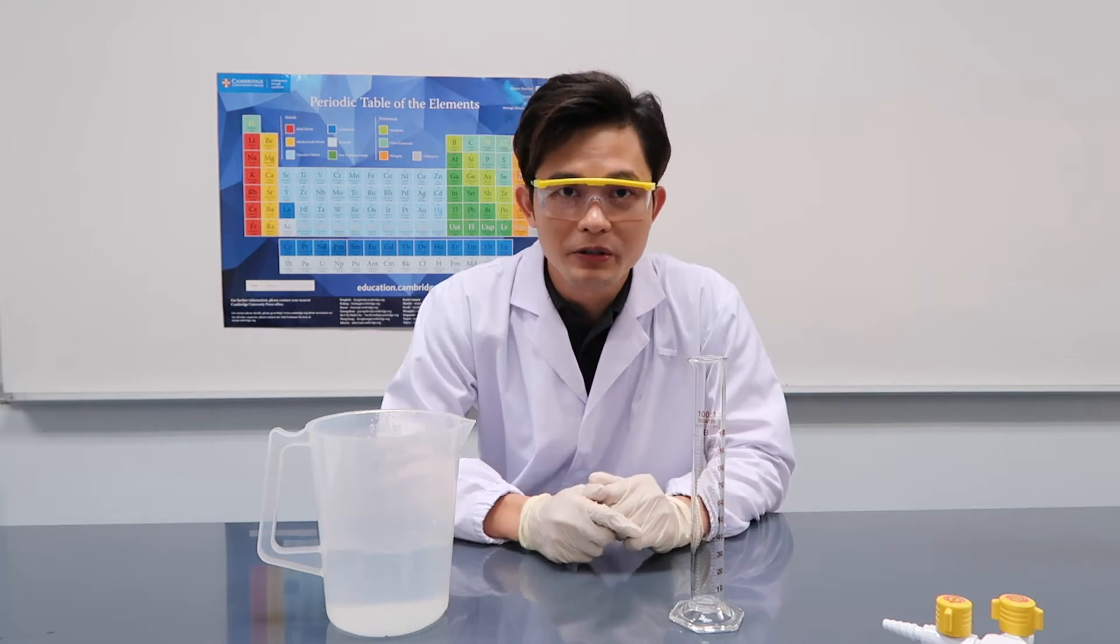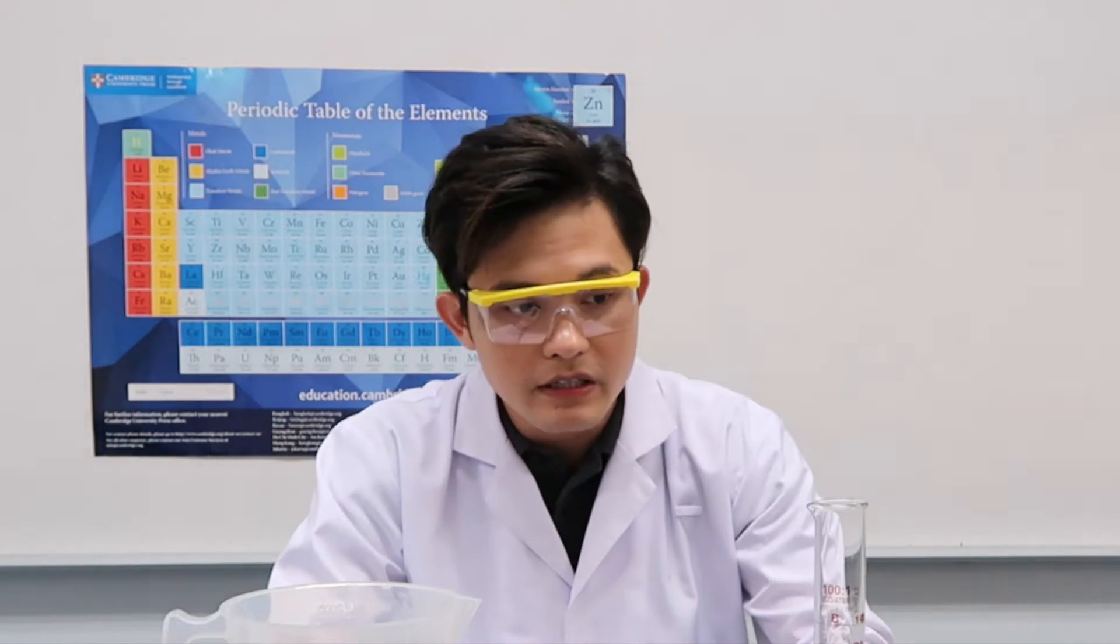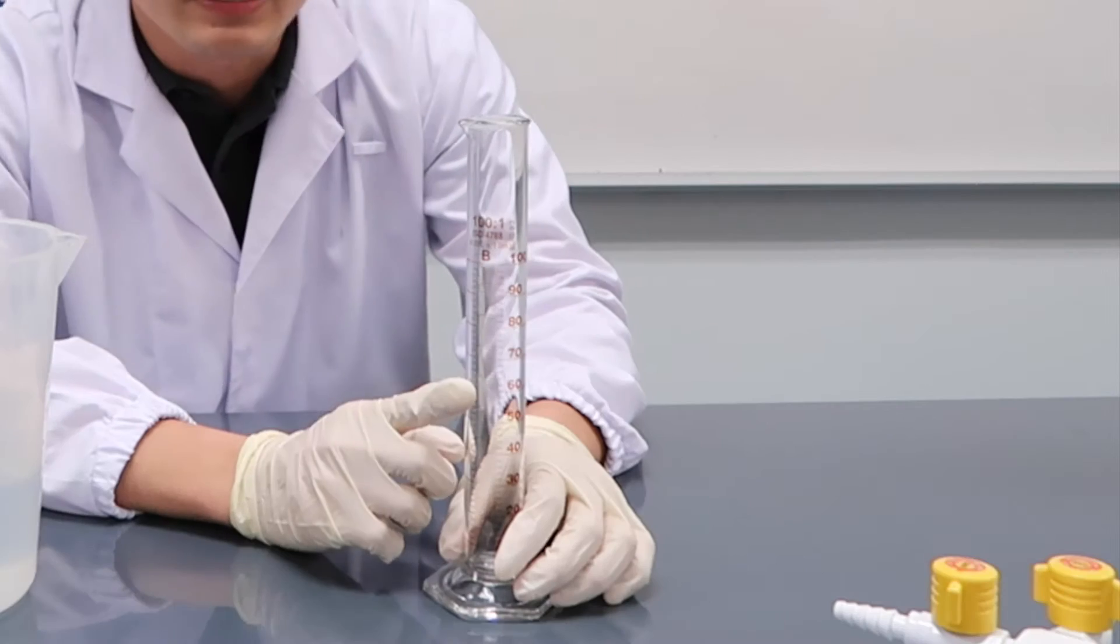This video for today, I'm going to teach you how to properly read the volume of a liquid using a measuring cylinder.